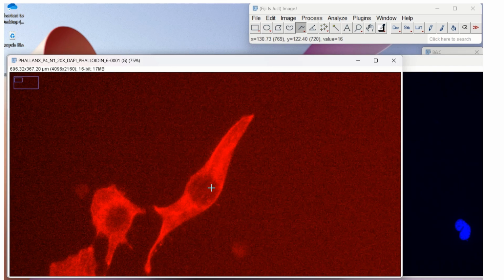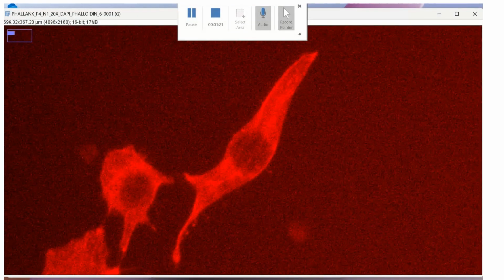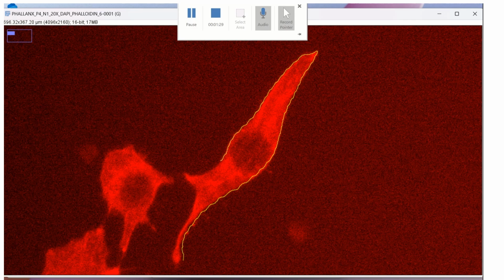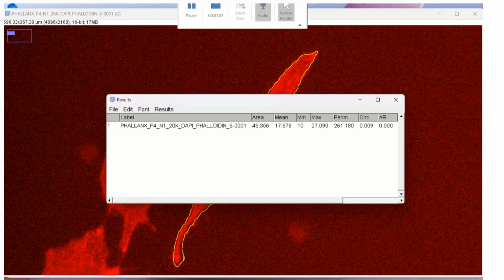So what you do is, I have a pen, but you can use your mouse or your finger if you have a touch screen. We're going to select this little guy up there in the manual right there, that one. And we're going to go ahead and outline our cell. Okay, I made this full screen and now it's just easier to see where the outline is going to be. Okay, and then you press Control M. So that gave me my first measurement.